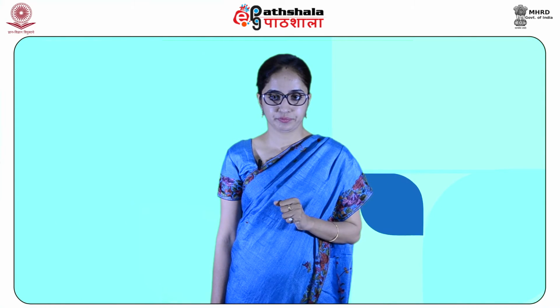The reference compound for 19 fluorine NMR is trichlorofluoromethane, that is CFCl3.